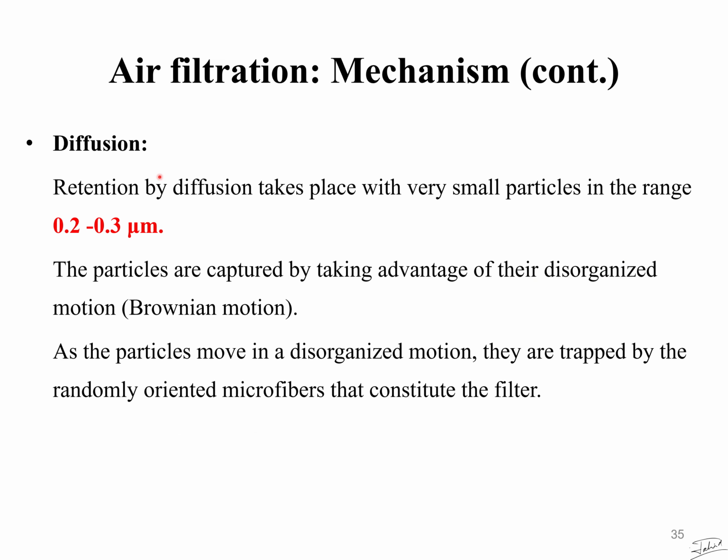The last one is diffusion, that is the Brownian diffusion mechanism. These particles have a very small size, like 0.2 to 0.3 micron. These undergo Brownian diffusion, and as the particles move in a disorganized motion, they are trapped by the randomly oriented microfibers that constitute the filter.